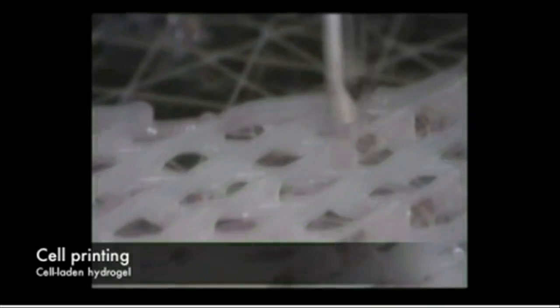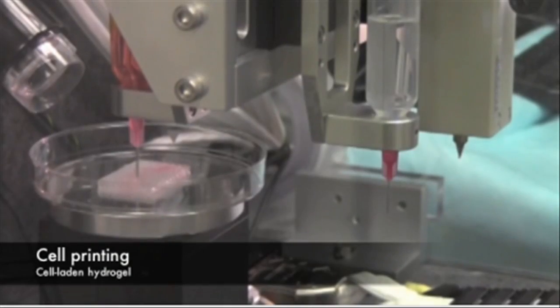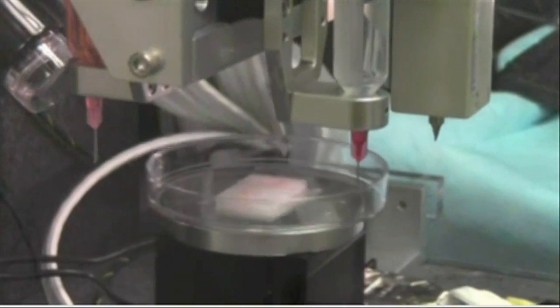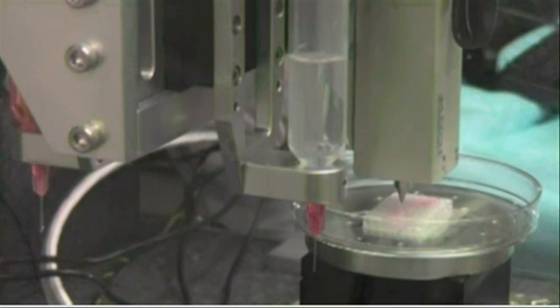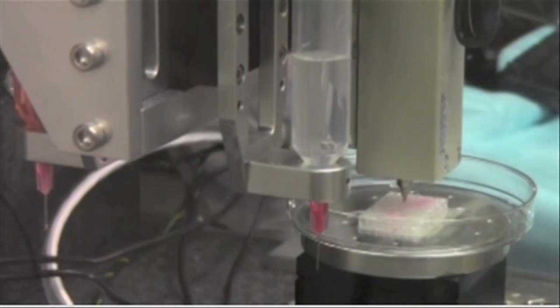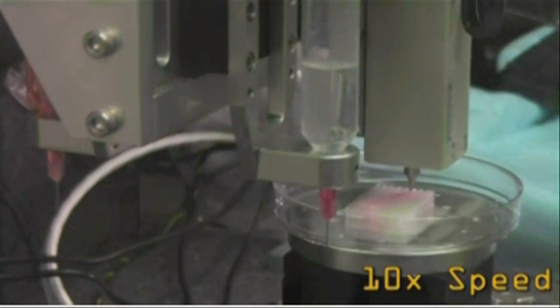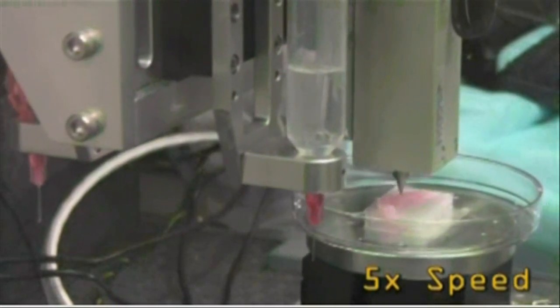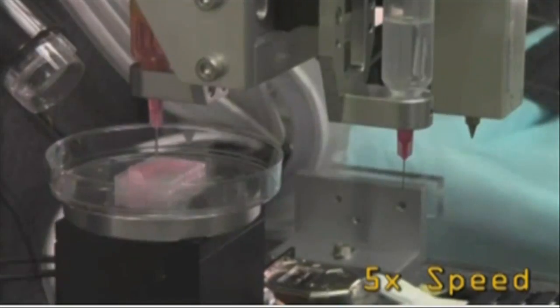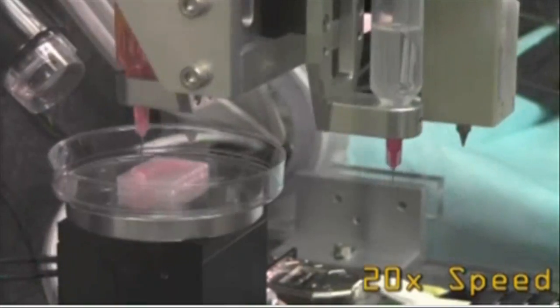To demonstrate that ITOP can generate organized soft tissue structures, printed muscle tissue was implanted into rats. After two weeks, tests confirmed that the muscle was robust enough to maintain its structural characteristics, become vascularized, and induce nerve formation.